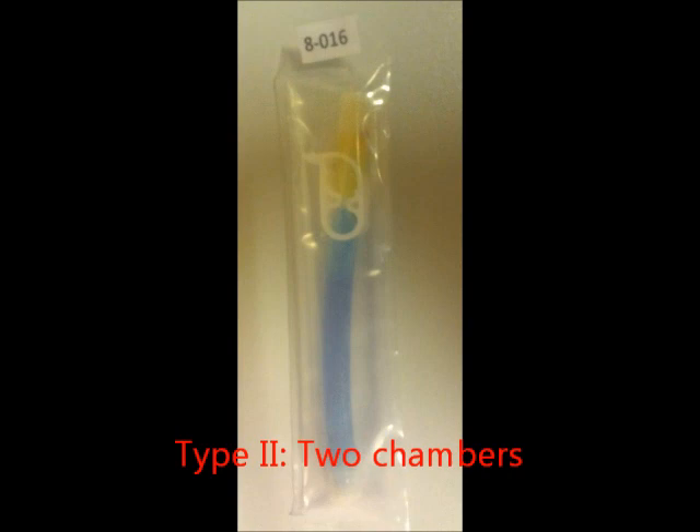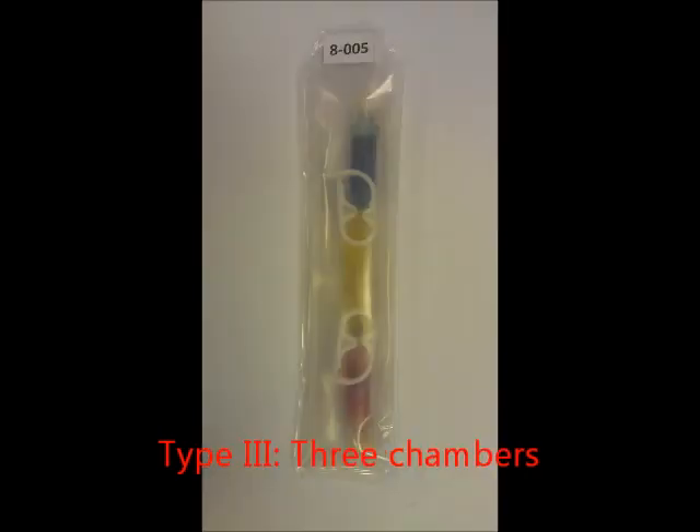In this video, we will work with a type 2 mixture tube, which has two chambers, and a type 3 mixture tube, which has three chambers.